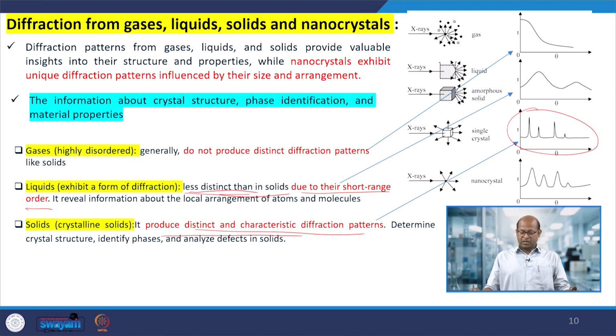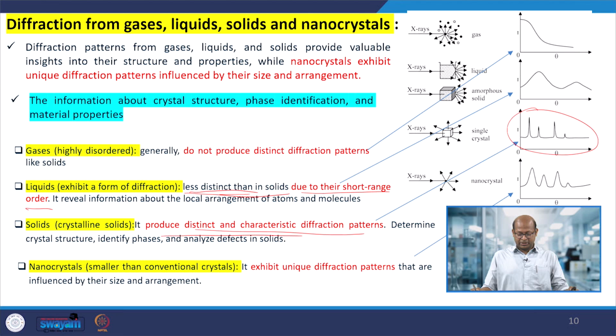Nanocrystallines are smaller than conventional crystalline materials, so they give unique diffraction patterns influenced by the size and arrangement of atoms present in the nanocrystals.